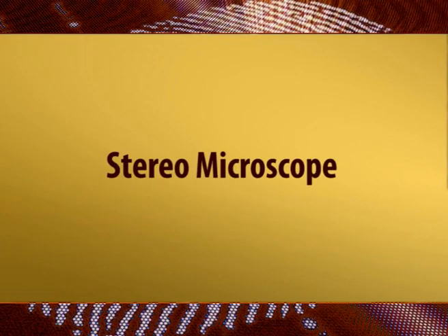The light emitted initially interacts with the fluorophores present in the sample, which then emit light of a longer wavelength. It is this emitted light which makes up the image. Then comes the stereo microscope.